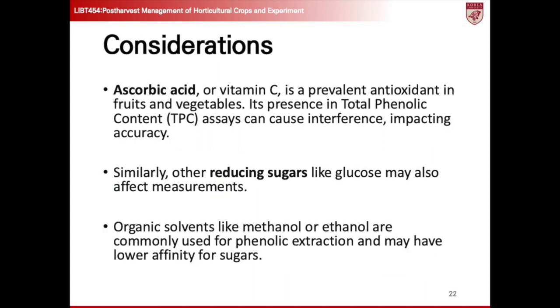Ascorbic acid, also known as vitamin C, is a common antioxidant found in fruits and vegetables. In total phenolic content, TPC, assays, its presence can interfere, affecting the accuracy of measurements. Similarly, other reducing sugars like glucose may also impact TPC measurements. To mitigate interference, organic solvents such as methanol or ethanol are often used for phenolic extraction, as they may have lower affinity for sugars.